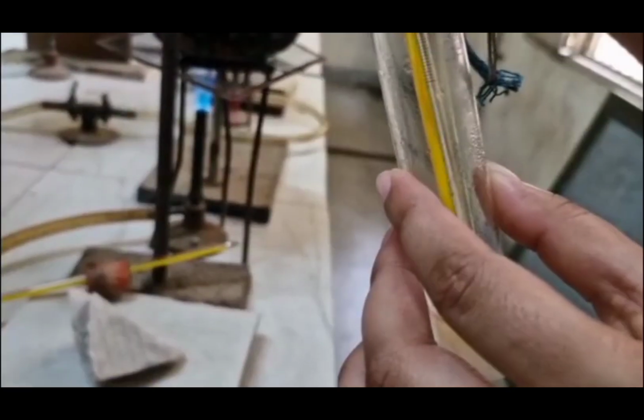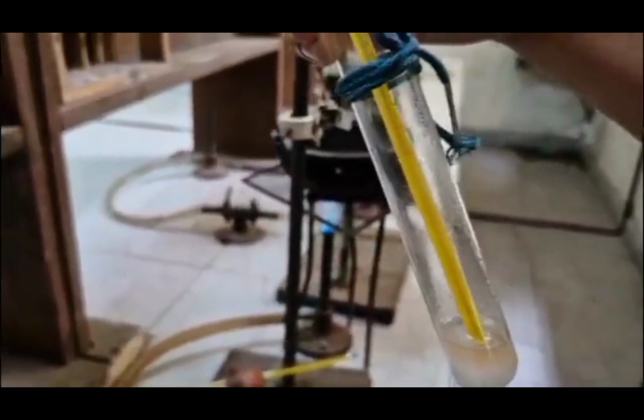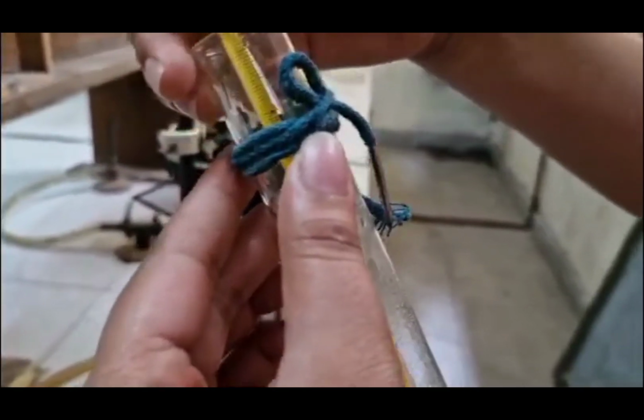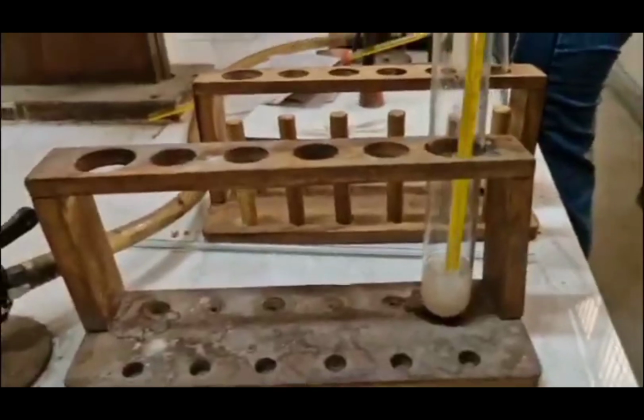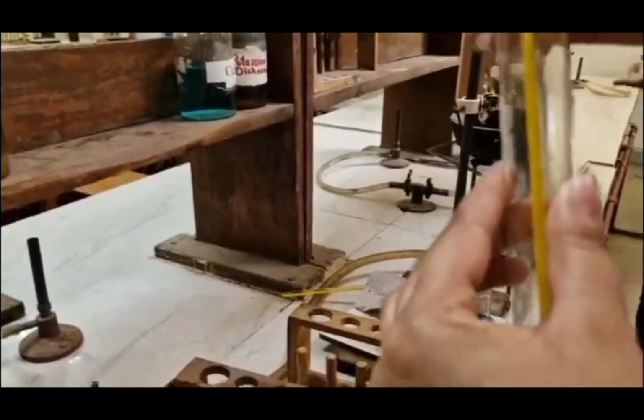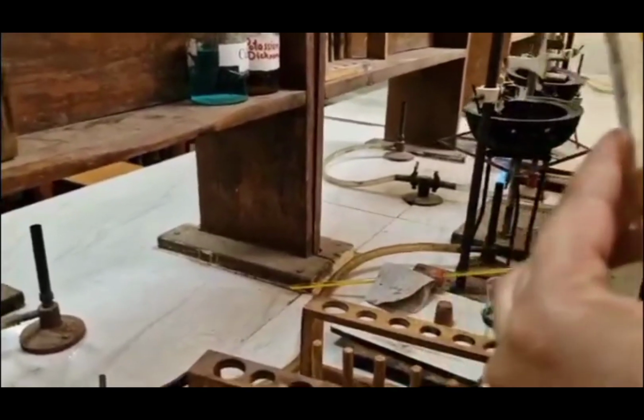Now we can see that in the NaCl water system, turbidity appears and note down that temperature. After cooling the water phenol system, we can see that here also our turbidity appears and note down that temperature.